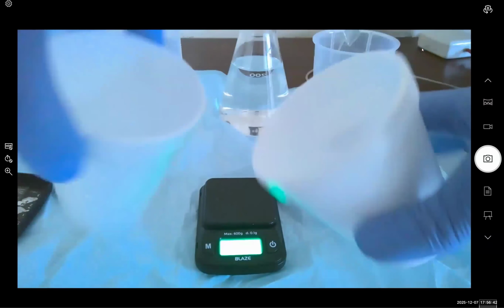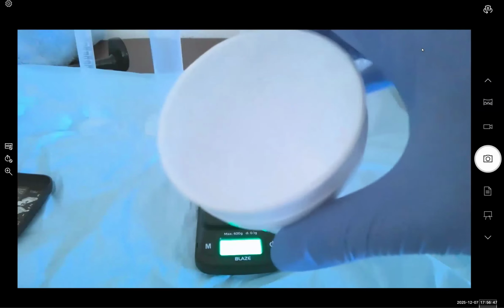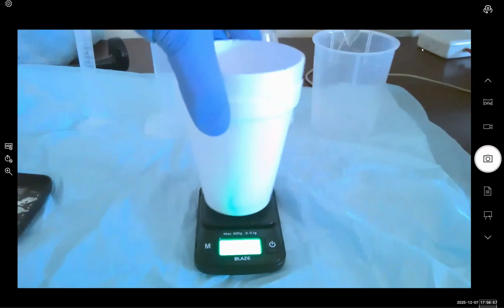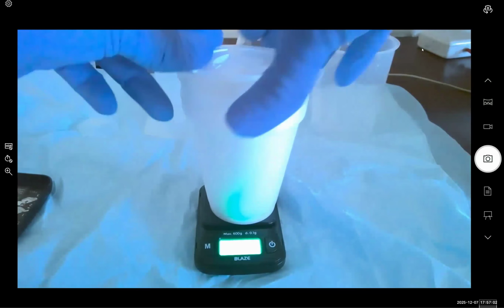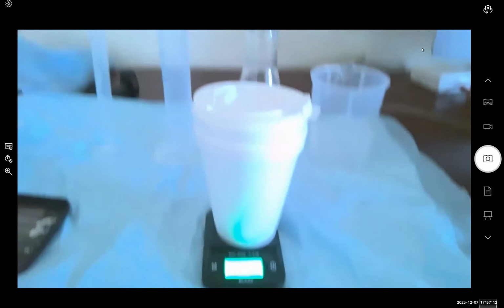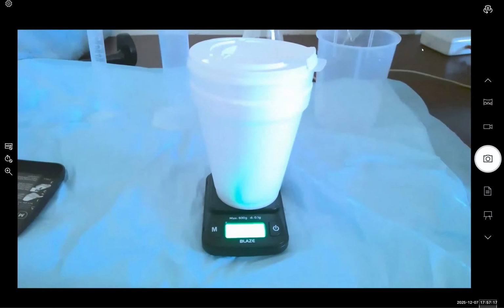So here I prepared a coffee cup calorimeter, which is 2 styrofoam cups. This is a surprisingly useful tool for calorimetry experiments that works quite well and can allow us to calculate reasonably accurate specific heat values. So now I'm going to place my coffee cup calorimeter on the balance and put the top onto it, and I'm going to tare it. This in turn means that any water we add to it, we can just weigh it directly on the balance without having to do any subtraction operations. The balance is already doing that for us.